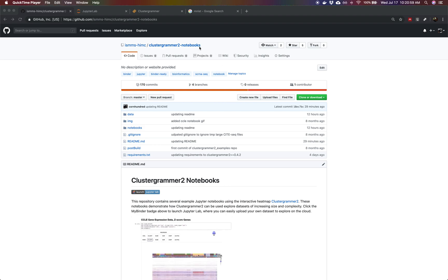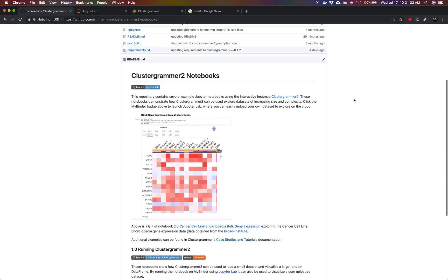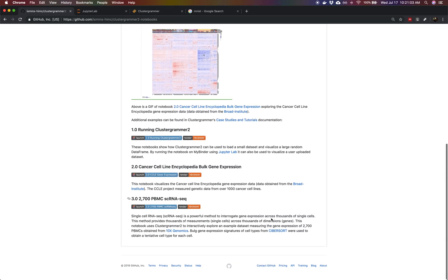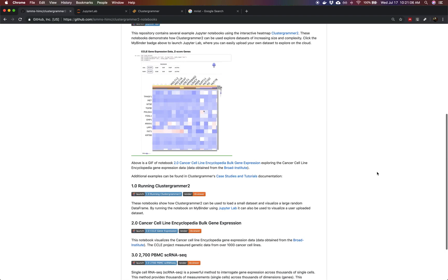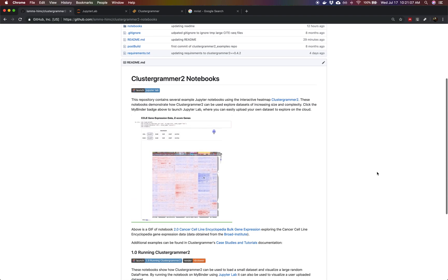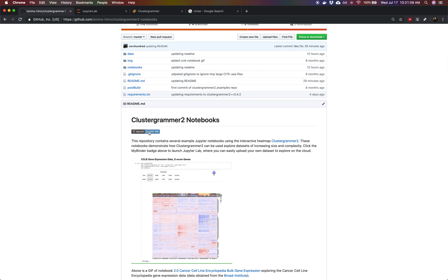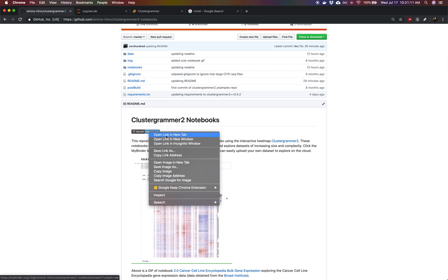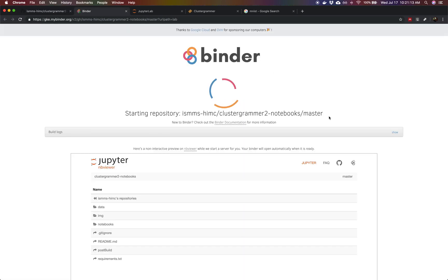So we're going to start at the ClusterGrammar 2-Notebooks repository on GitHub. This repository contains several example notebooks to walk you through analyzing different datasets. For this example, we're going to click the launch JupyterLab badge. We're opening this in a new tab.